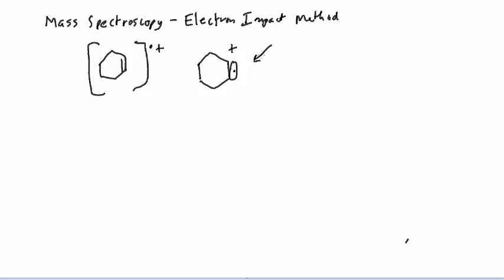All right. In showing the fragmentation pattern, it's convenient to use one of the resonance structures corresponding to this. So let me do that now. The odd electron here can be placed on either this carbon or that carbon. Let me start it on this carbon, and the other carbon here is positive.